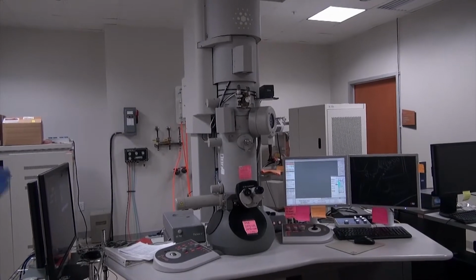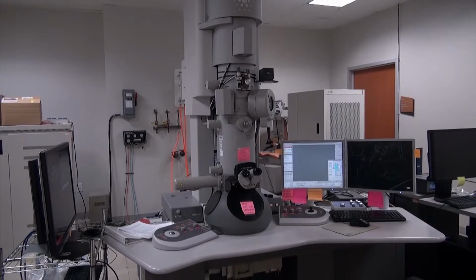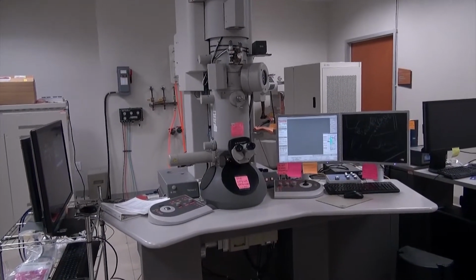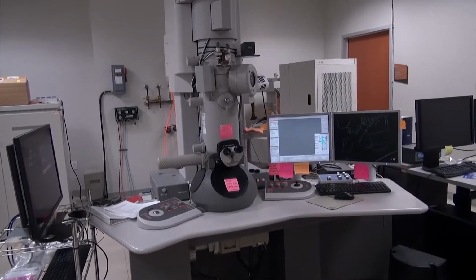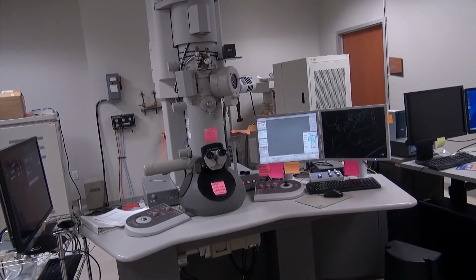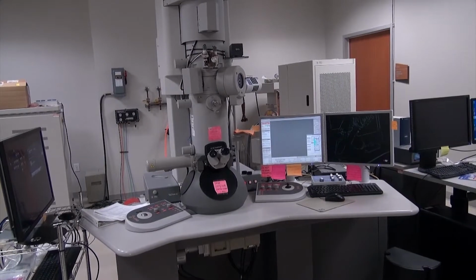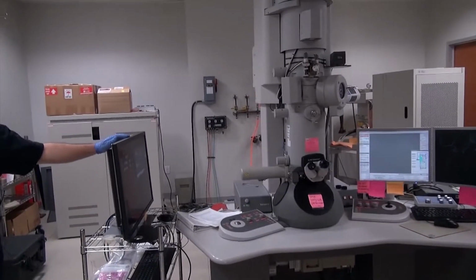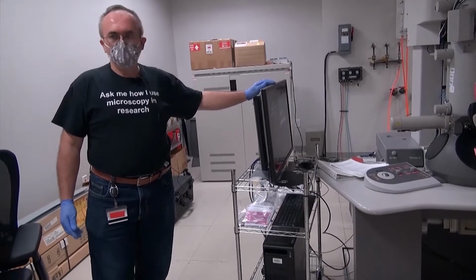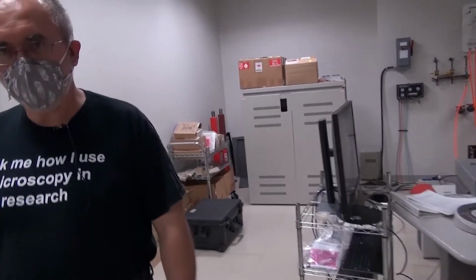The resolution is about 0.24 nanometer in point resolution, and it's equipped with Gatan cameras, actually 2 of those. The stage is computer controlled, accepts single and double tilt holders. And we also have a recently installed NanoMegas ASTAR system and Protochips heating stage that are available for our users.